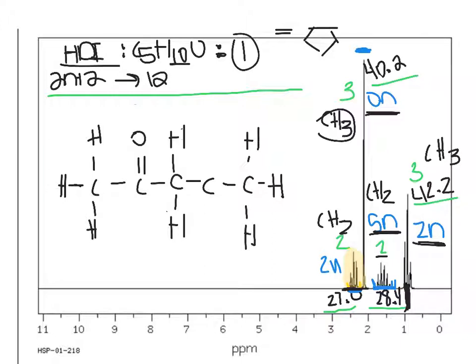And then this makes sense because our other protons that we just skipped over a second ago, right here, would fit perfectly right in this spot. Right, and if we look there, that means that these 2 protons do have 5 neighboring protons.